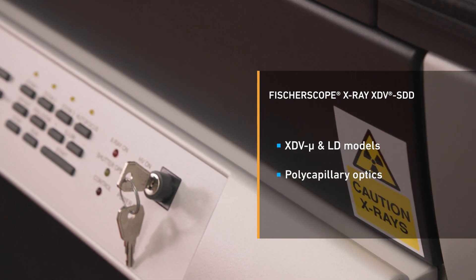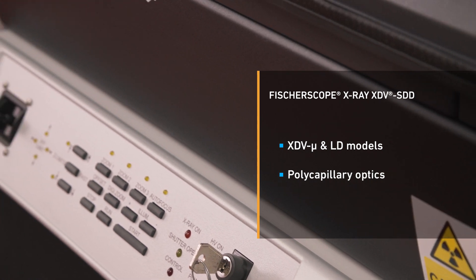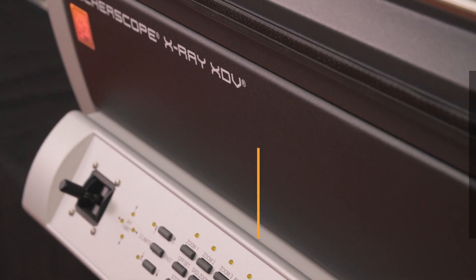In summary, the FischerScope X-Ray XDV-SDD is the high-caliber all-arounder — the premium universal XRF analyzer for automated measurements of very thin coatings.